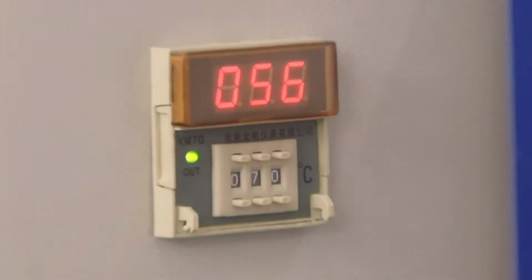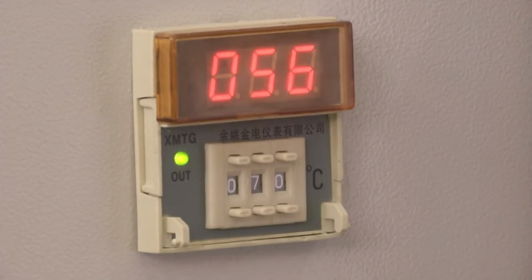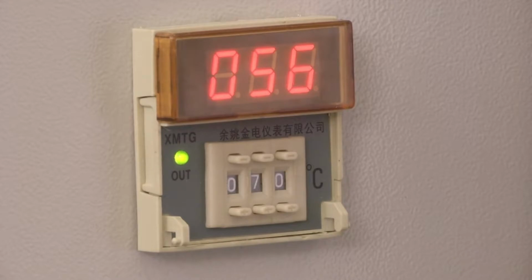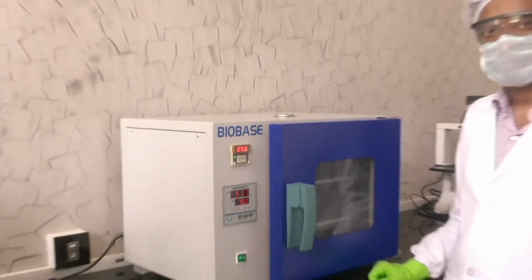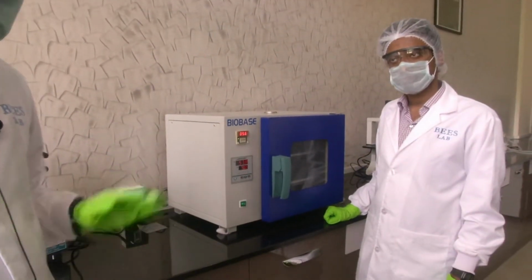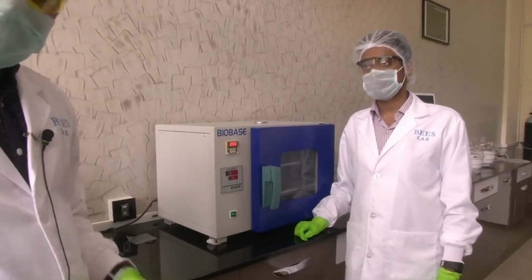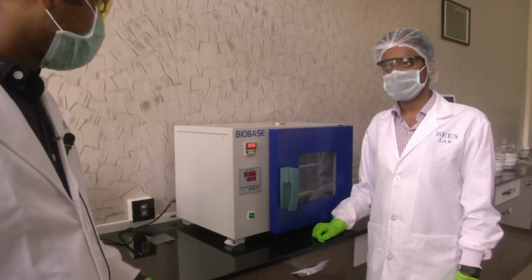If you can see, there is another display shown above this touch panel display. That is a control system from another point within the oven. So basically the oven will have sensors at different points inside that chamber. From those sensor points, this control system will sense the temperature inside, and it will accordingly change the temperature so that it will go to the target temperature. These two are from different sensors within the oven, and they work together to give you your target temperature. That is the whole idea.